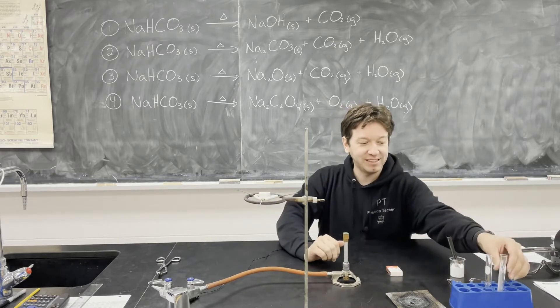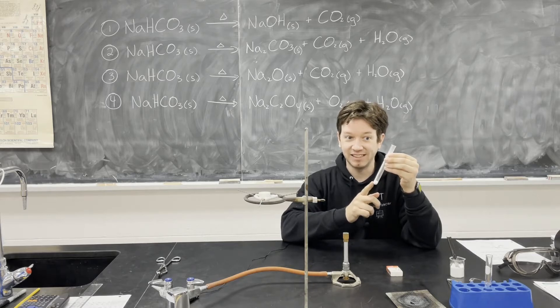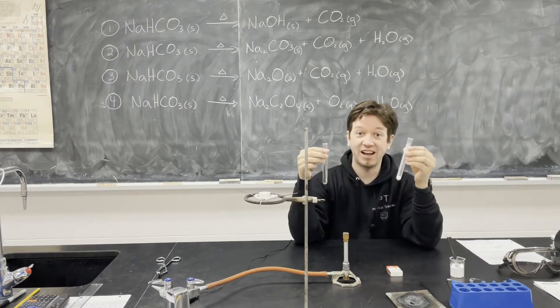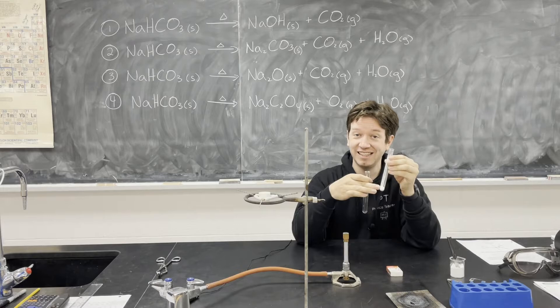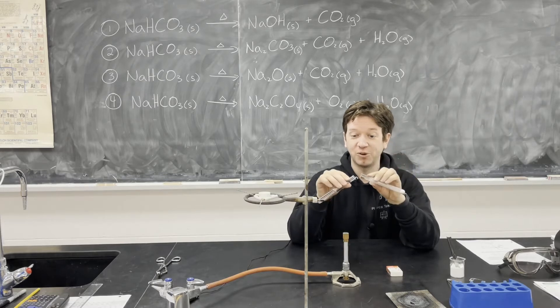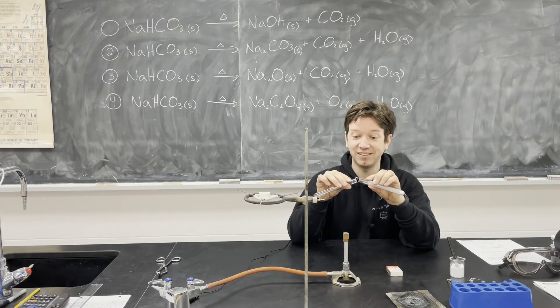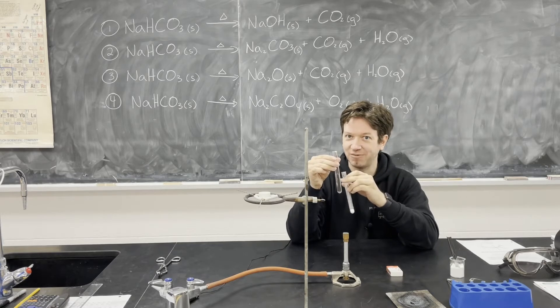I've already placed some baking soda in this test tube and in this one I have lime water. So we're going to heat this to get the reaction and we're going to let the gases flow into the other test tube to see if a precipitate forms.